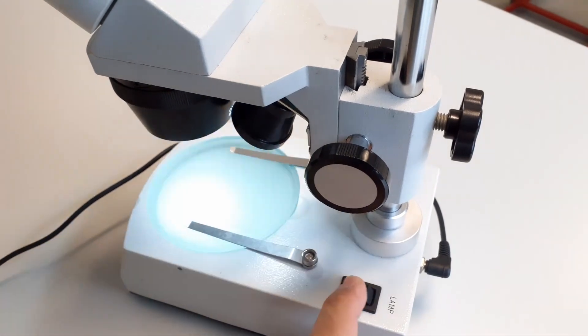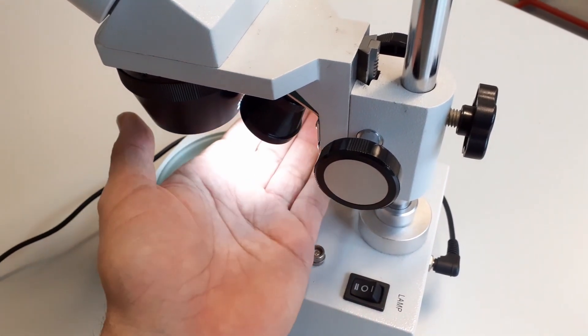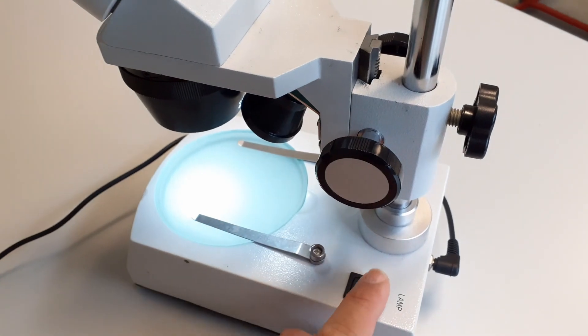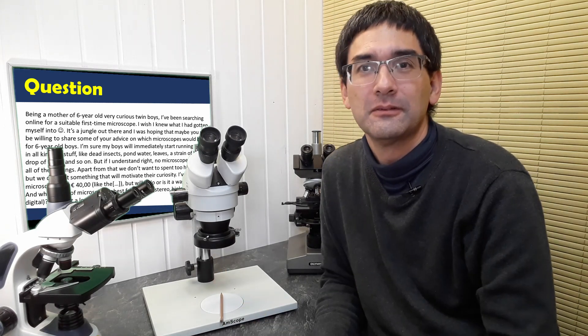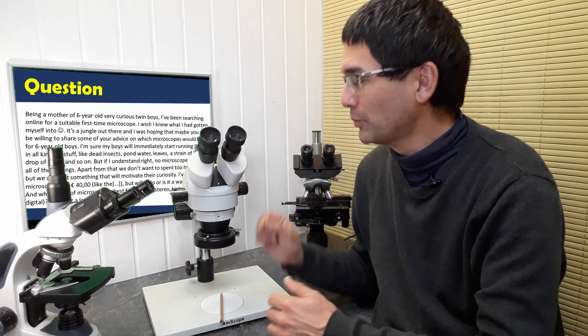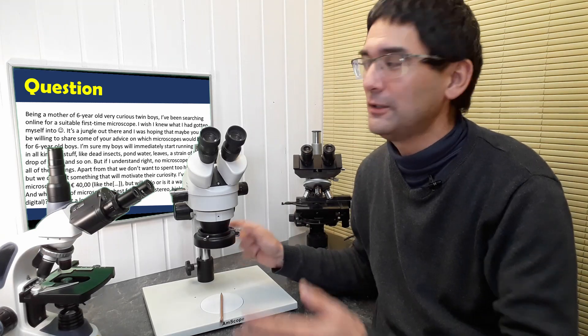But the important thing here is the following. If you want to look at an object, any object, insect, plant material, this pencil here, all you have to do is you take the object and you put it on the stage of the microscope, you switch on the light, and then you look at it.